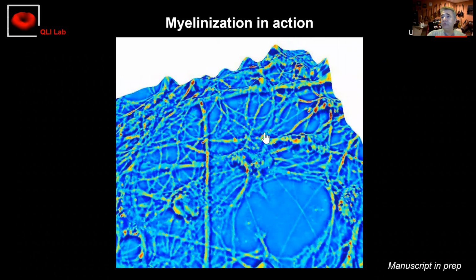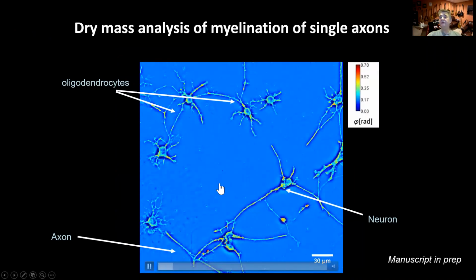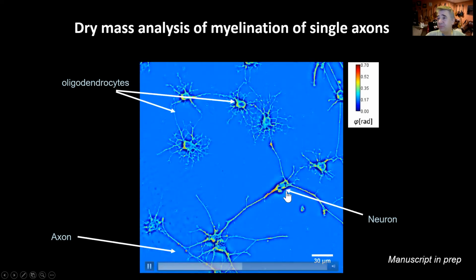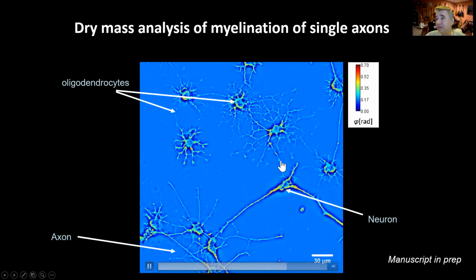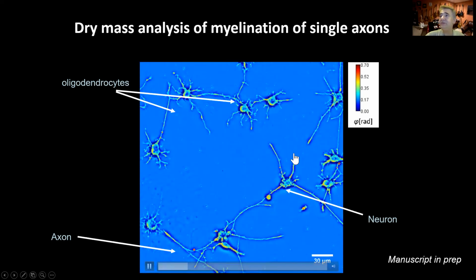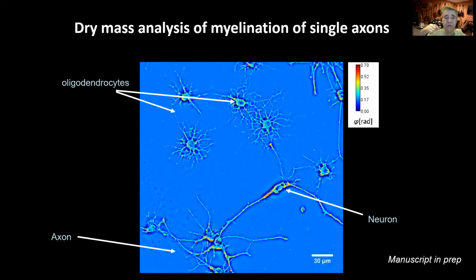So we realized that this network is too crowded for us, so we went back and designed an experiment where things are more clear. So look at these oligodendrocytes now. And this is the neuron. And this is the oligodendrocyte. It starts to wrap on this here. And then something happened. I don't know, that retracted, another one. So this is something fascinating. This takes place over a couple of weeks. So the full myelination of that 20 nanometer layer takes 2 weeks to generate.